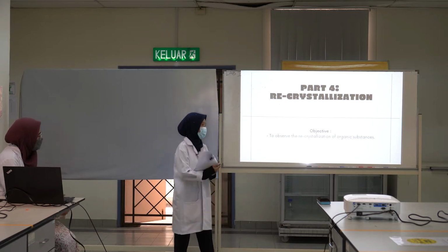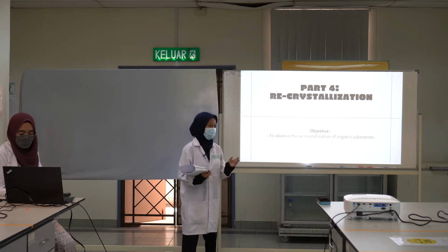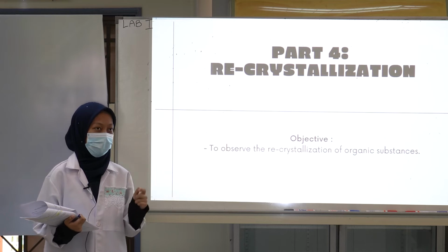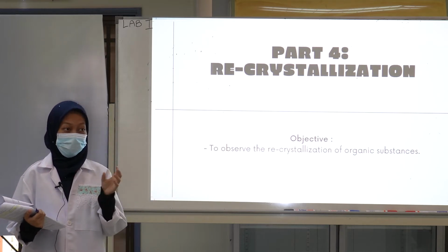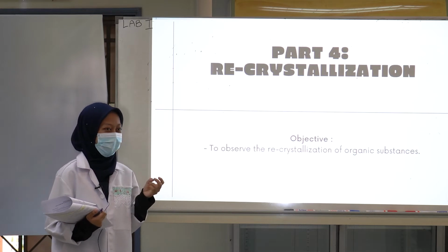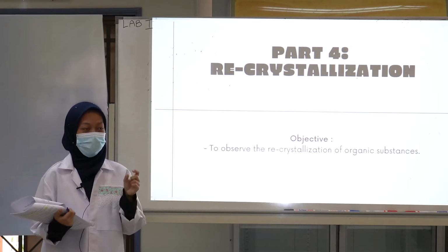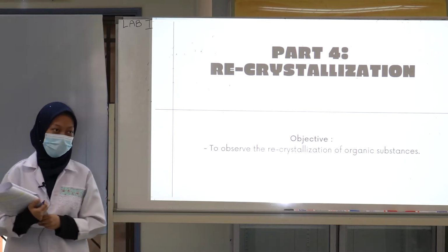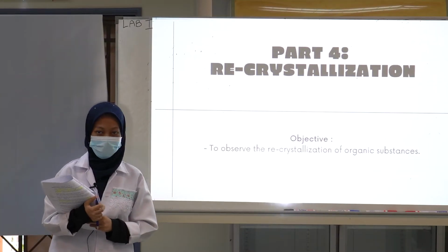So now I will continue presenting about the recrystallization part. The objective of this part is to observe the recrystallization of organic substance, which is certain organic substance that will form crystal after a certain process.